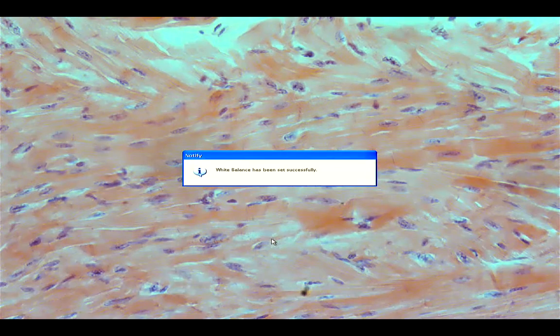see in the cardiac muscle would be the presence of intercalated discs. So intercalated discs would serve as the attachment site between muscle fibers. So this is an example of the intercalated disc. Another one, another one. Okay, so this is actually a linear, densely stained linear structure that would serve as the attachment site. And then you have the striations. There you have the striations.